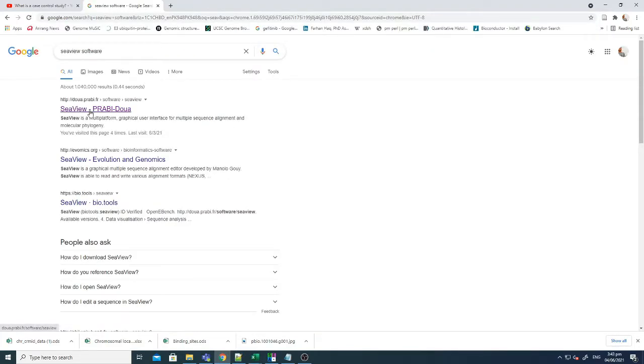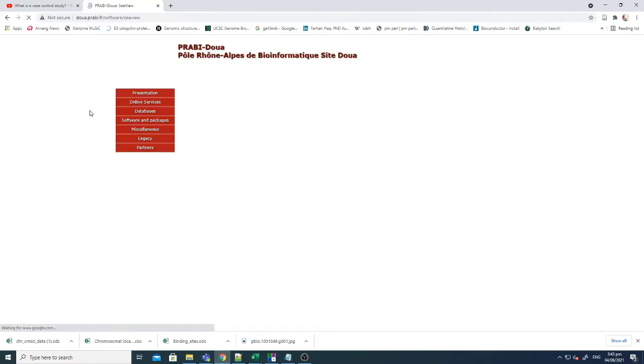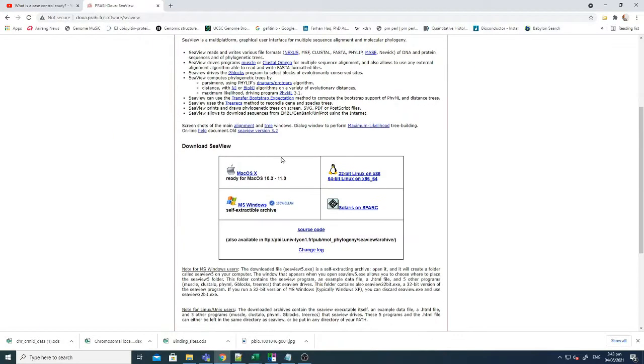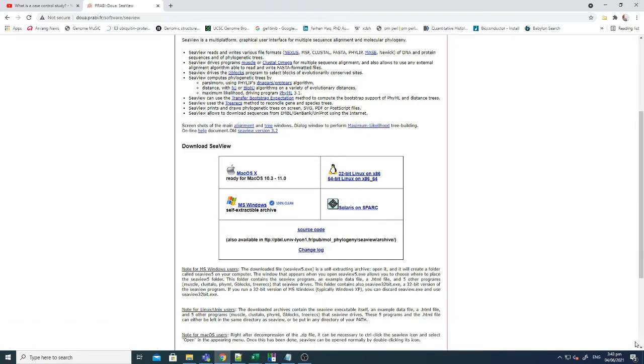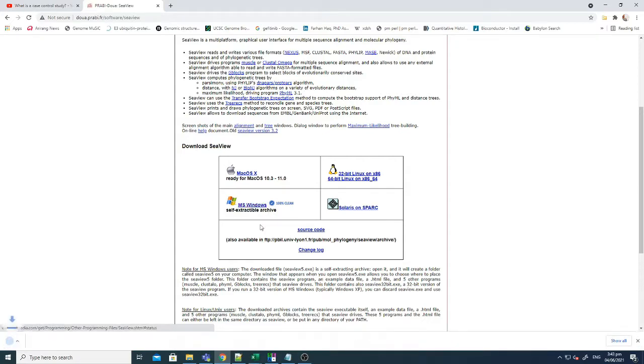Right now if you just click C view software it will go to the website and in this website here you can see that there are multiple options if you want to download for Mac, for Windows, for Linux or for Spark. So here I'm using Windows so I just download the Windows version. Just click it.